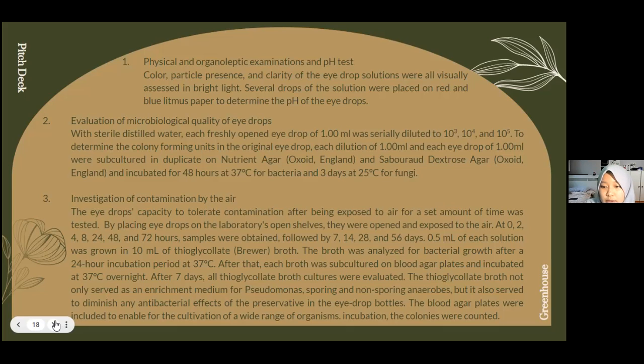The thioglycolate broth not only served as an enrichment medium for Pseudomonas, sporing, and non-sporing anaerobes, but it also served to diminish any antibacterial effects of the preservative in the eye drop bottles. The blood agar plates were included to enable the cultivation of a wide range of organisms. After incubation, the colonies were counted.